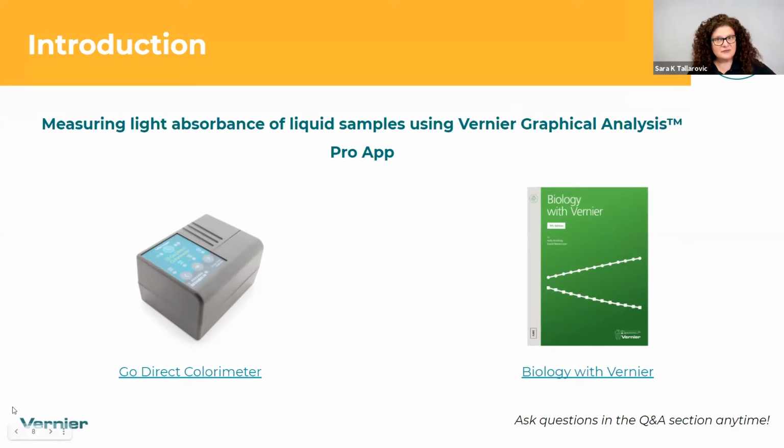Now, we do have other versions of this lab. We do have a version of this lab that is in the Investigating Biology with Vernier book, Investigating Biology Through Inquiry. That's a more, or I should say less structured way of doing it with students that gives the students the basic protocol. They can also, though, do inquiry-led experiments using this protocol from Biology with Vernier. It just gives them a little bit more guidance as they go through the instructions.